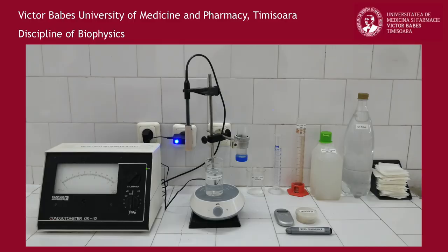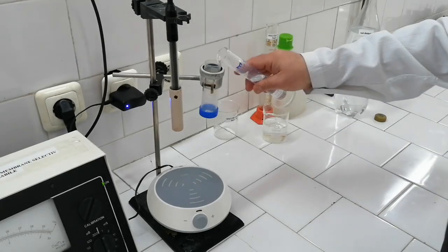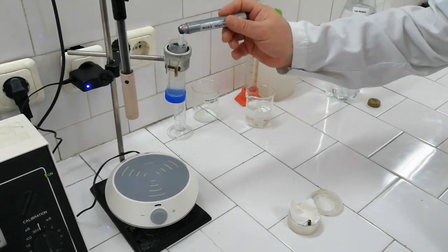In the first part of this experiment, you will measure the electrical conductance of water and that of saline solution. Using the appropriate graded cylinder, fill 30 ml of distilled water in the container equipped with a selectively permeable membrane. Rinse well the white magnet and place it in the same container.